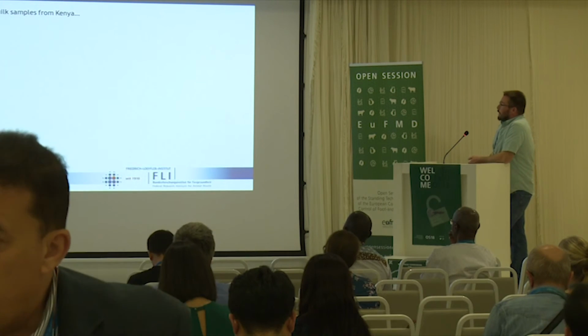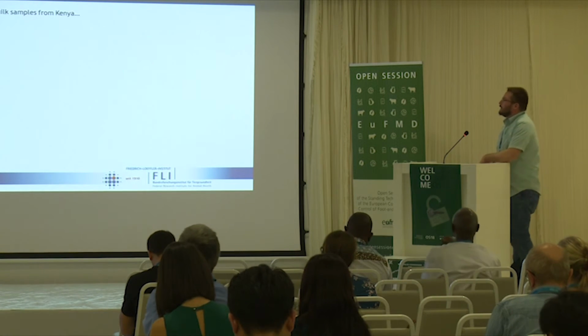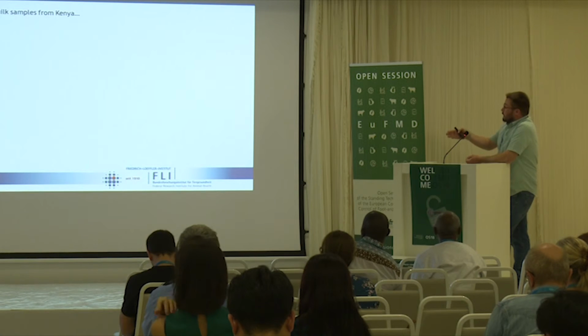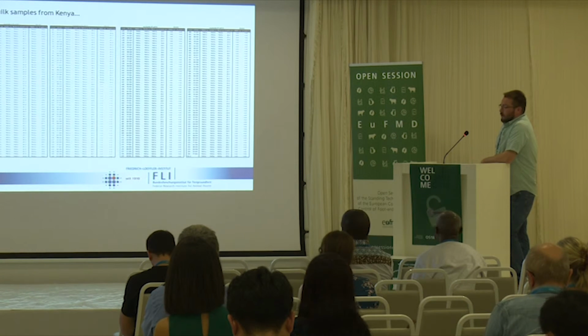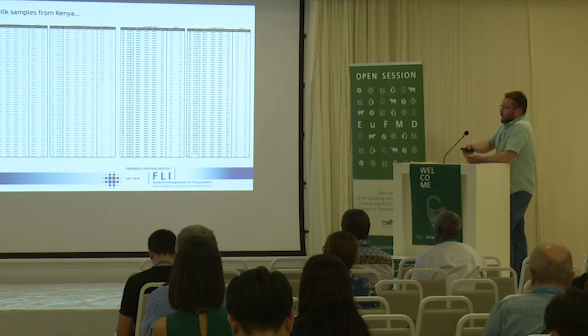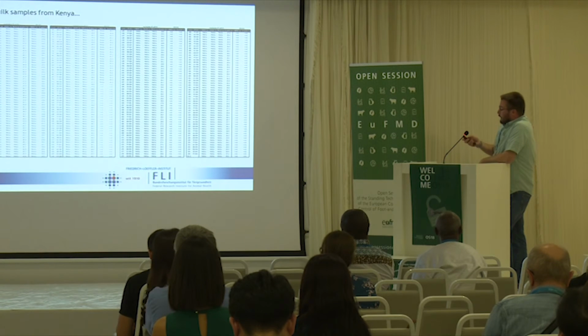Then, so this was the in vitro data, then samples from our own animal experiment, and then we got some samples shared from Pirbright, from Nikolaitz and Bryony, from the study that they talked about yesterday, and we tested them in the multiplex as well, and sadly we did not find anything, which I hope in this case really is only due to the fact that what Bryony has shown that their CQ values were beyond the 30s, so they were 30 plus, 35, even higher. And I do think that in that range, we are really not that sensitive.